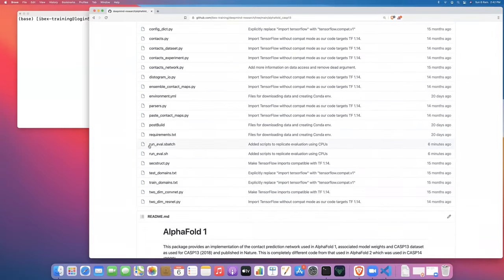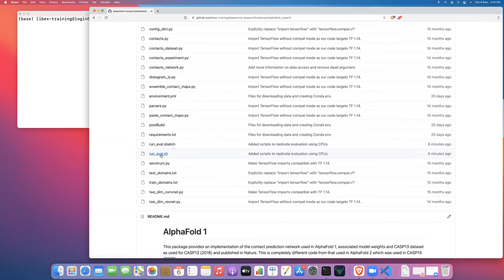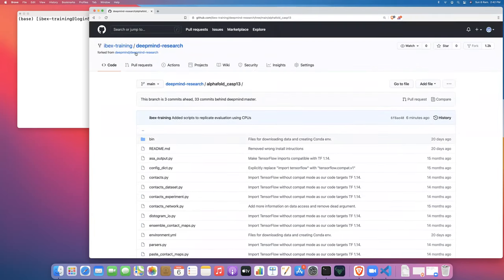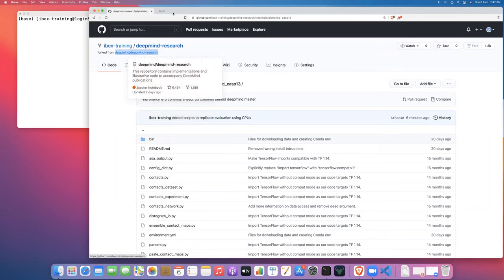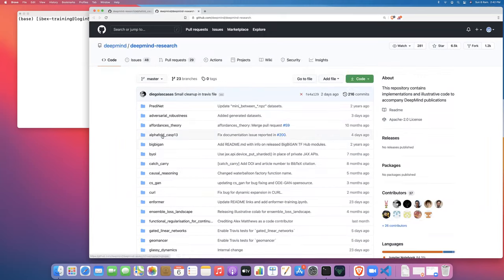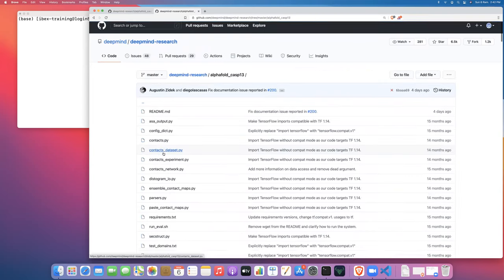One is run_eval.sbatch, which is going to be our Slurm job script that we're going to use to launch the AlphaFold inference job. The other is the run_eval shell script, which is a modified version of the same script provided by DeepMind. Before I go to the modified version, I'm going to go back to DeepMind's original version and show you the parts that needed to be modified.